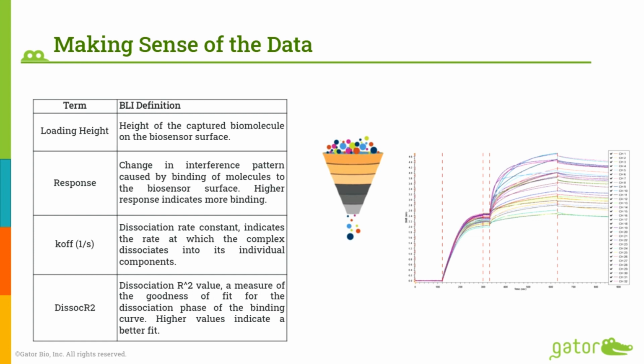The second checkpoint is response. So we want to see what is the amount of response of the periplasm. Now, if the periplasm itself binds very low, right? What happened in his case is that each of his plates, because of his platform, has so many positive leads that we had choices to eliminate or set up a cutoff threshold of a certain nanometer height, below which we would not look.